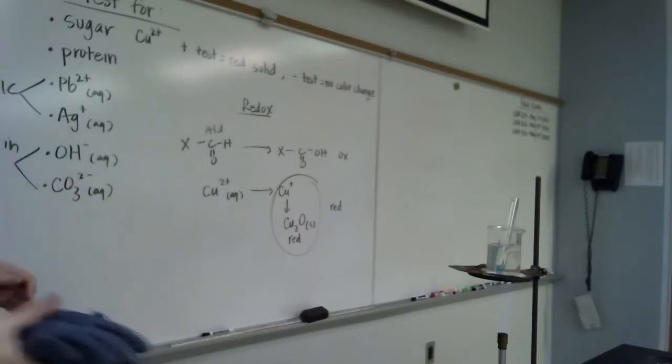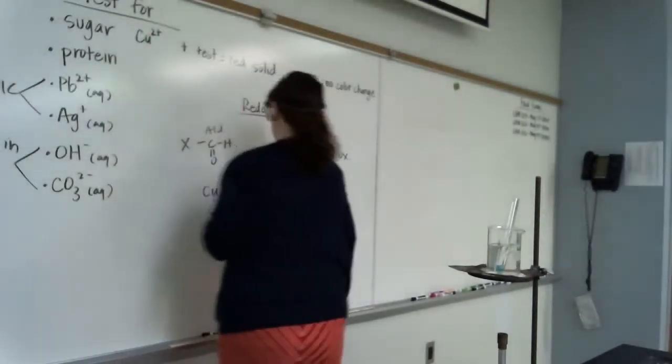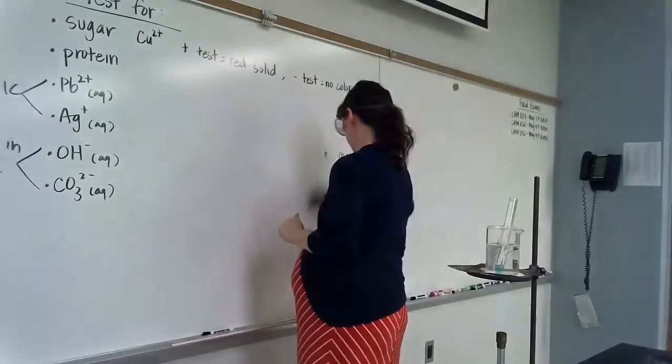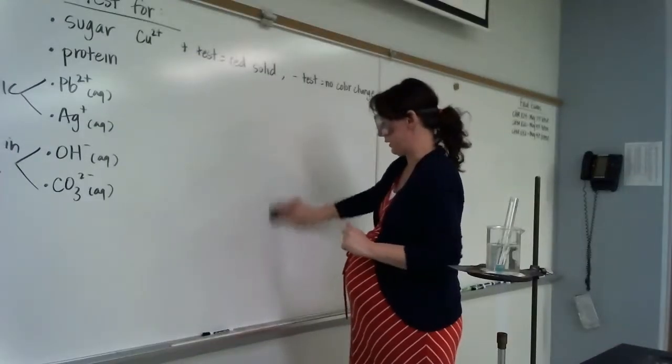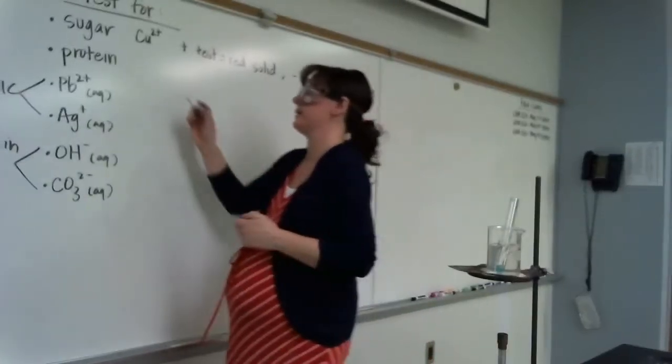Now let's talk about what test we'll do for the presence of protein. So we're also going to use copper to test for the presence of protein. Now, proteins are made out of amino acids.